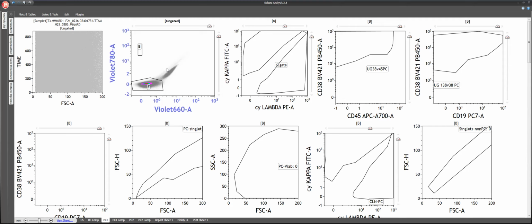We can also use normal plasma cells if we have enough of them, which can also indicate representation of bone marrow. So these are the four parameters which can indicate if the marrow is dilute or not. It is very important, because if the marrow is hemodilute and your MRD is negative, then your sample may not be representative, and you may end up giving a false negative.